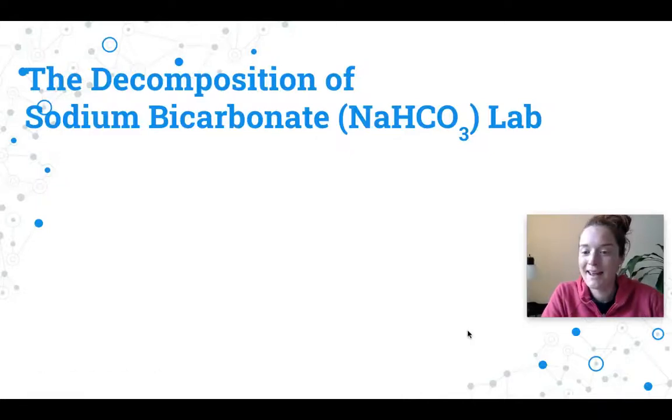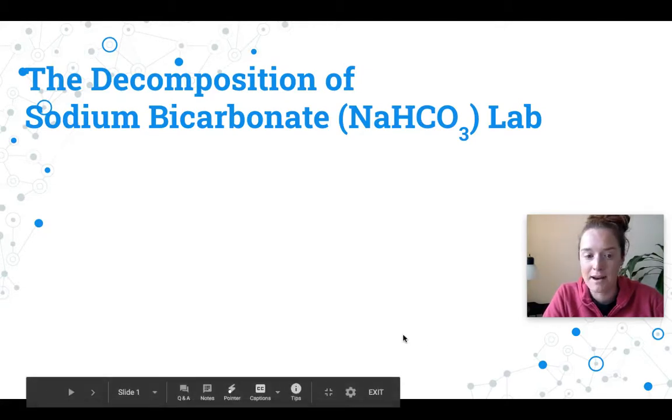Hello, everyone, and welcome to the final week of the third quarter of Honors Chemistry. This week, we are doing one of my favorite labs. It's called the Decomposition of Sodium Bicarbonate.